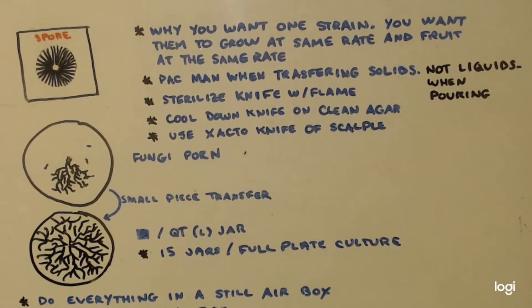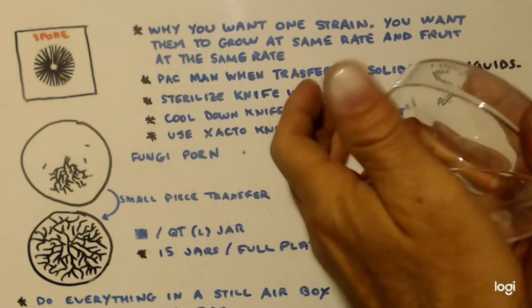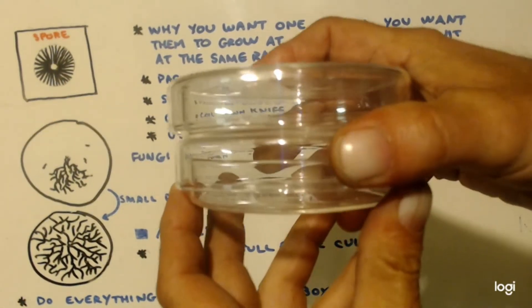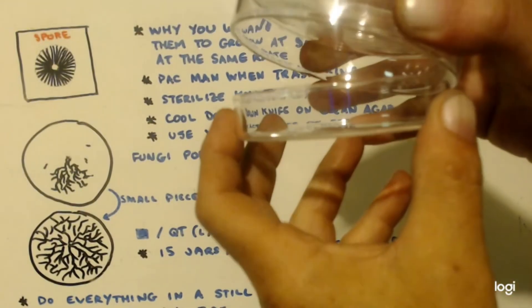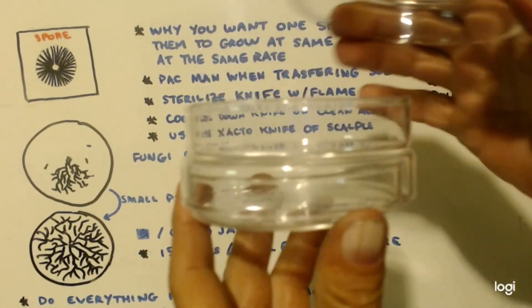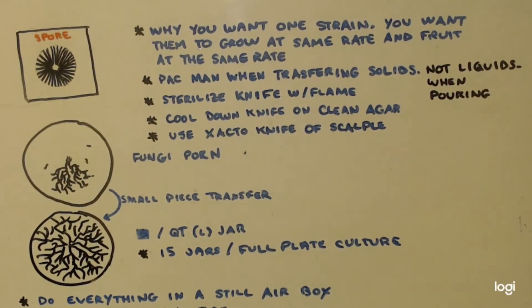When you transferred your agar to the petri dishes — that was a liquid you were pouring — you do not Pac-Man. This is Pac-Man, where you just lift the lid up like that. You never do that when you're pouring a liquid, because you don't have enough space. You always go like this: if you're doing plates, you pick it straight up, go a little bit over, and then pour. You'd have the plates stacked, so you'd pick the whole stack up and move it over, otherwise your whole stack would fall over. That's the only time you should not Pac-Man.